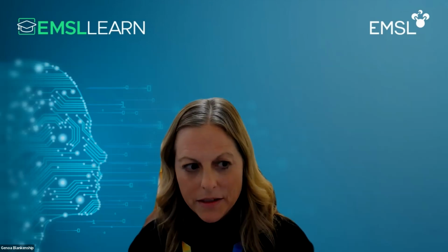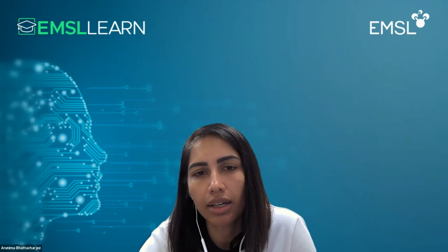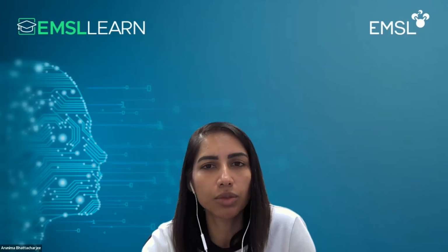Thank you. Larumia Faria's question is regarding the microchannel devices made with PDMS. How were the minerals incorporated into it? So you can basically mix them in with the PDMS, and the M Systems paper that we cited in our slides goes into specific details on how you can do that. But we don't use PDMS anymore for mineral devices. We use epoxies and other polymers. It's just easier. It's also better compatible with mass spec.